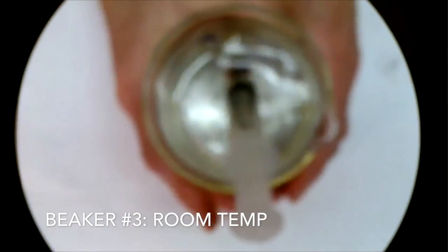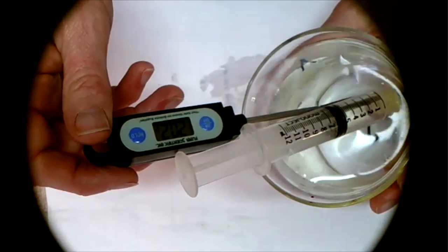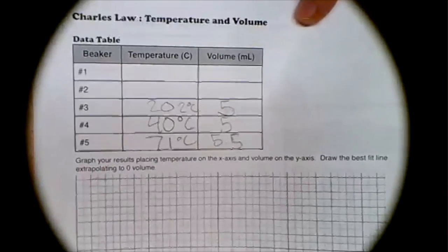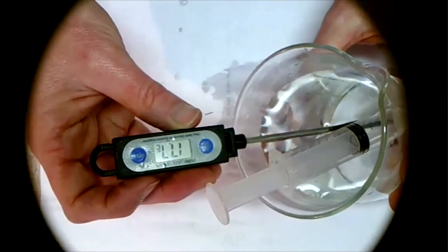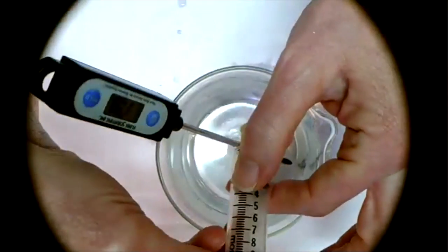This one is the cooler tap water, but it doesn't have any ice in it. So there we go, 20.2 degrees Celsius. This one, 17.7 degrees Celsius.